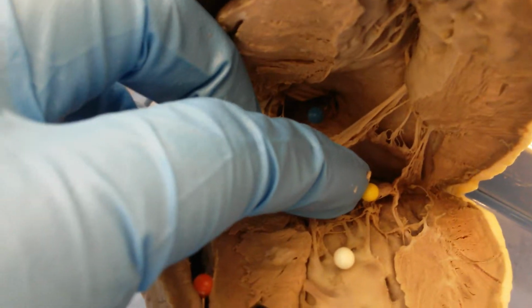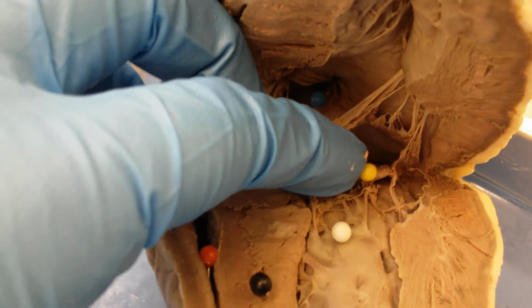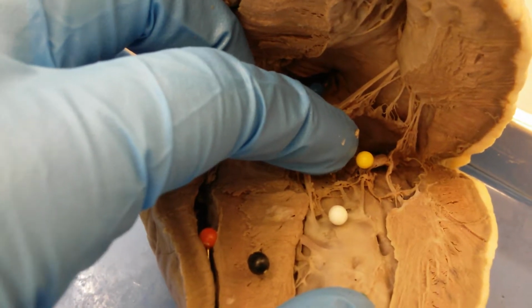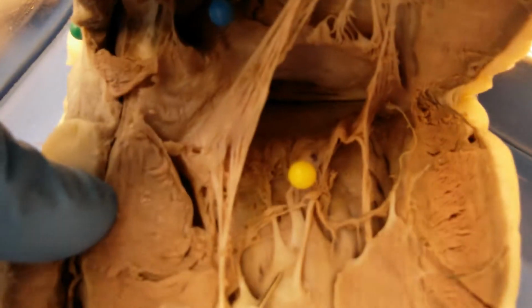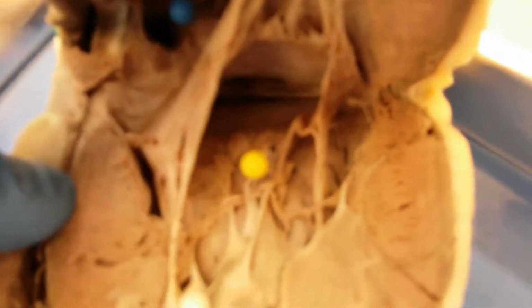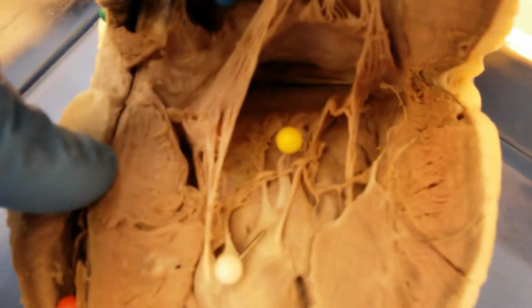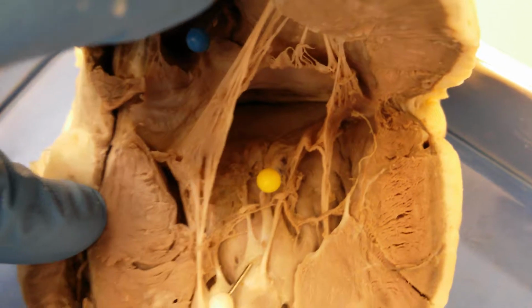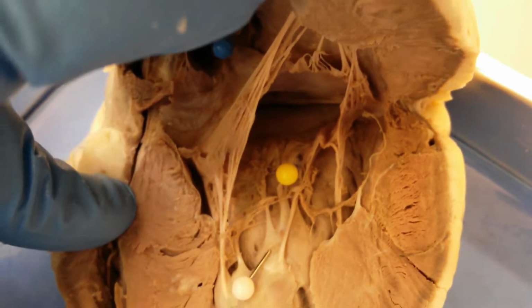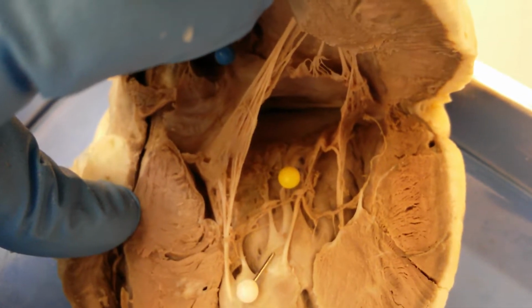So these are these unmarked cords right here, and these actually pull on the bicuspid or mitral valve, which is marked right there with the yellow pin. I'm not sure if I can show this, but the bicuspid valve actually has two cusps, which are really hard to focus, but you will see them as two structures. We will see them in the lab.